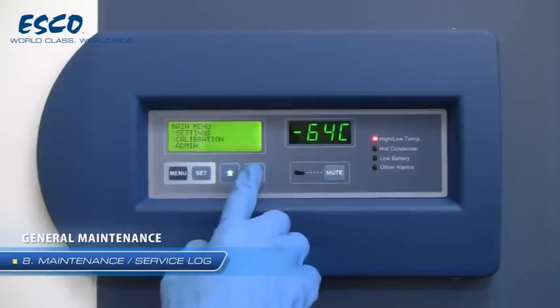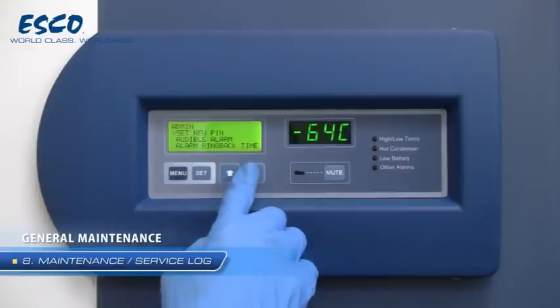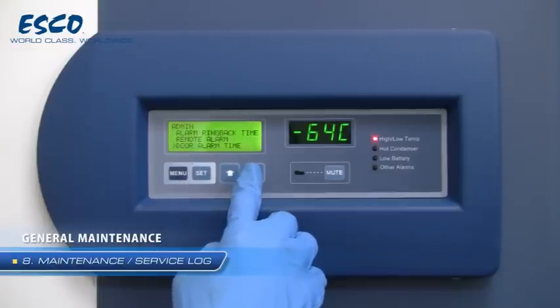It is good practice, and in some cases a regulatory requirement, to maintain a log of all maintenance work carried out on your freezer.